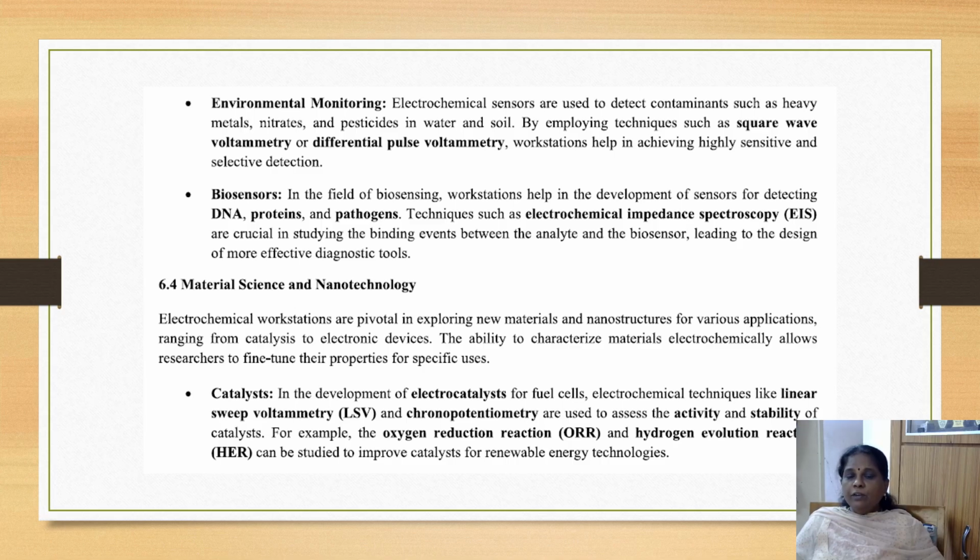Biosensors: in the field of biosensing, workstations help in the development of sensors for detecting DNA, proteins, and pathogens. Techniques such as electrochemical impedance spectroscopy are crucial in studying the binding events between the analyte and the biosensor, leading to the design of more effective diagnostic tools.